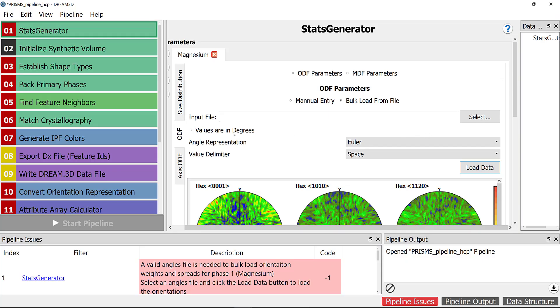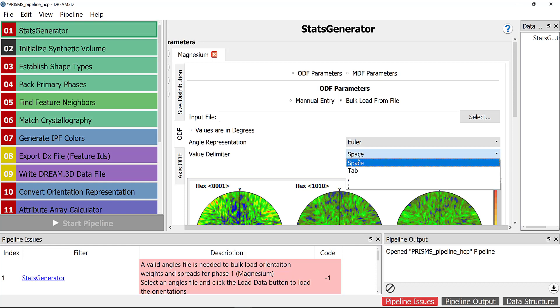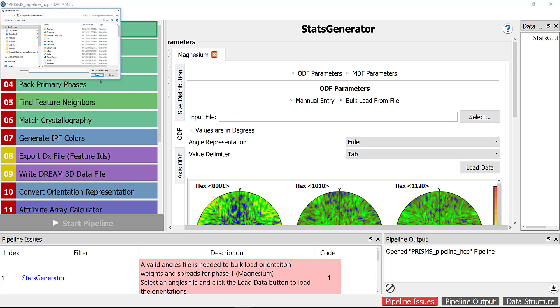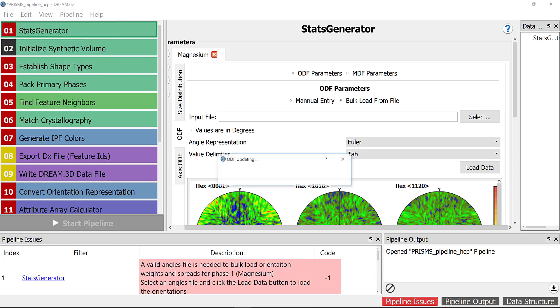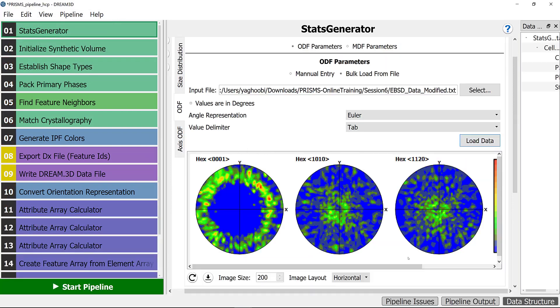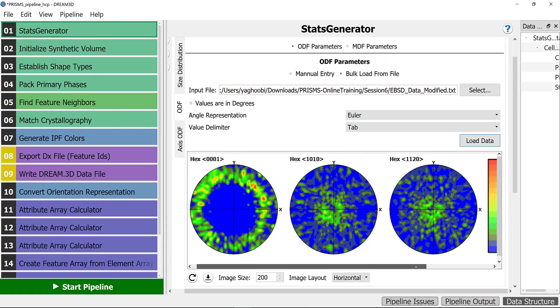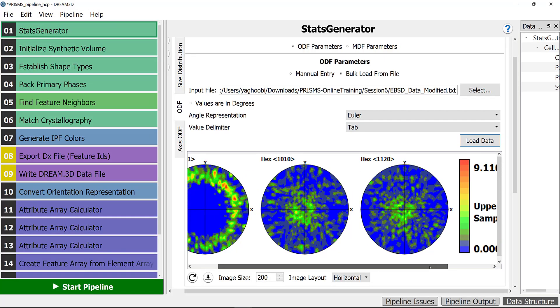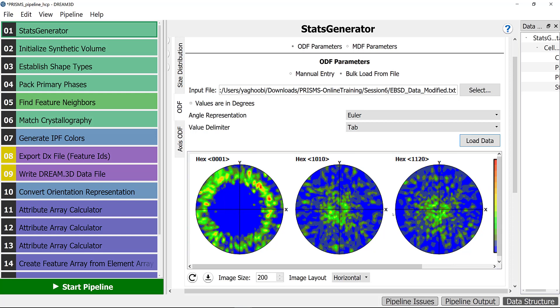Let's go back to DREAM.3D. We make sure that the values are in radians or if you find the orientations are in Euler and delimited with tab. We just need to select the file that we just modified and load the data. First thing, you can see the pole figures of this sample.